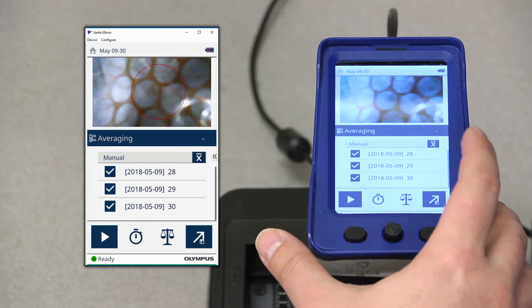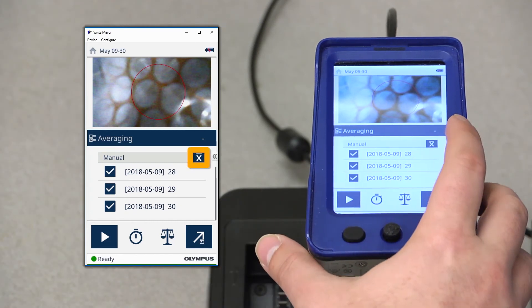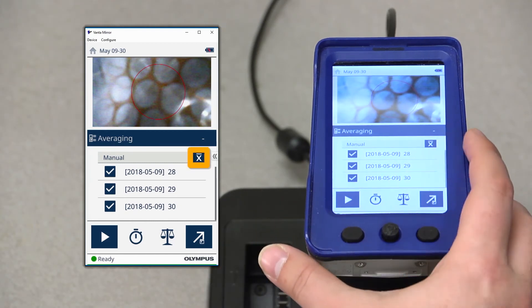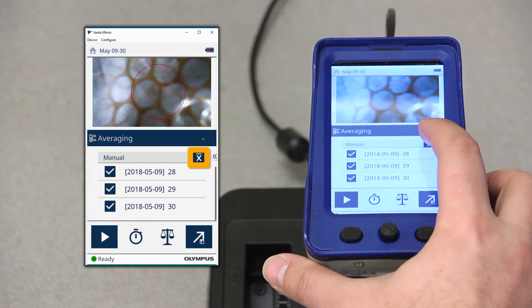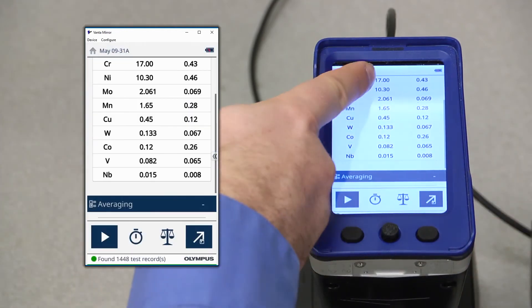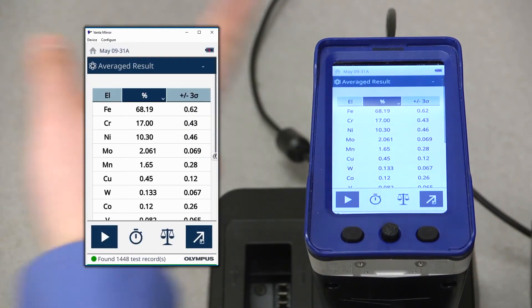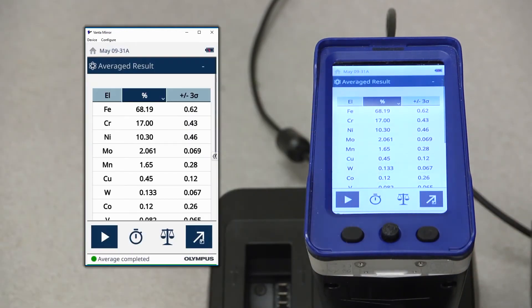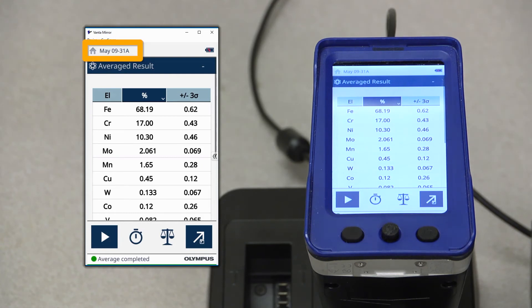Once you've selected all the ones you want, press the averaging icon on the right-hand corner here. And with that, we've generated an average result. You'll notice that the average result has an 'a' suffix at the end of the result number. That lets you know that it is an average result.